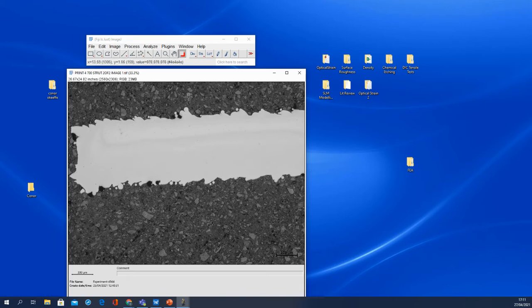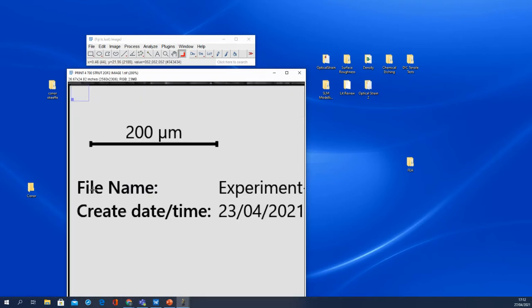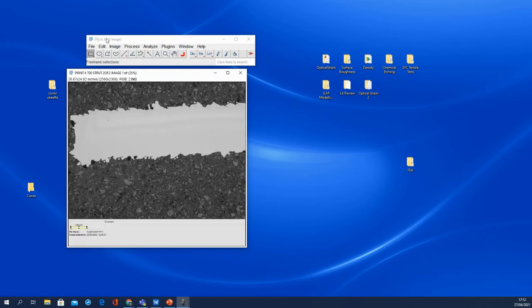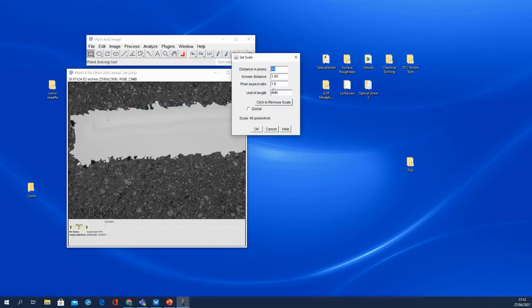So instead, I'm going to use the method that I'm going to describe now. So first of all, I'm just going to set my scale. So I go down to my scale bar, I can pick any tool here, so I'm going to pick a rectangle, say. Okay, so 233 pixels. Okay, so now I'm going to set that scale, so I go analyze, set scale, 233.